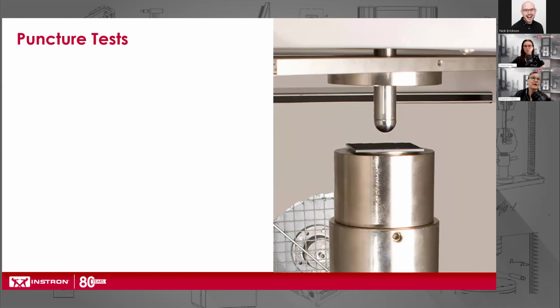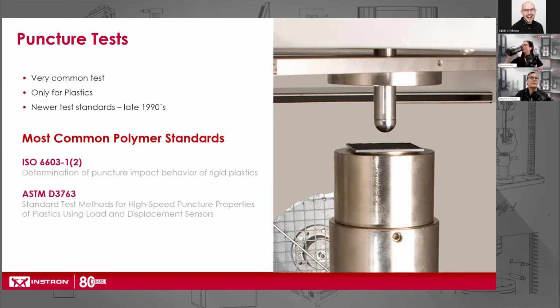So puncture tests are a common test, used only for plastics, and they're newer test standards, as you'll know. The puncture test standards came about in the 1990s. The most common ones are ISO 6603-1 and -2 and ASTM D3763.